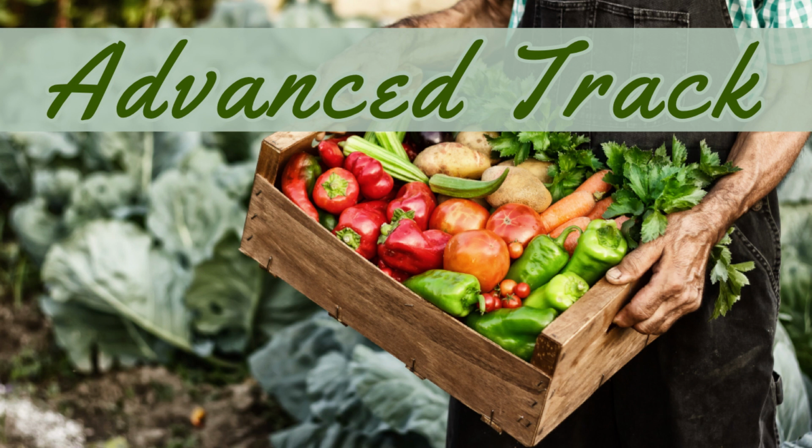So, this is a slide. Just support it. Goes down. Consistent spot, though. Put one drop right in the center. Put the lid back on. That'll get you. All right?